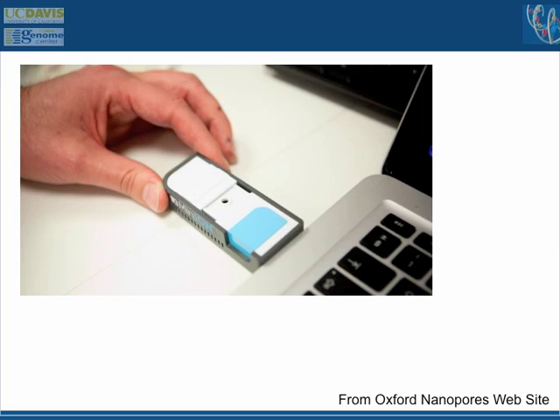So it's unclear exactly what you need to do to feed this machine, if you call that a machine. But there are a few other companies that have been trying to do field DNA sequencers like this. Again, I don't know what the DNA preps for most of them are going to be, but this is single molecule sequencing, very fast, reasonably high throughput. None of the methods that are out there have even come close to the Illumina throughput right now. So for a while at least, if you want to get deep coverage of something, or if you want to count things like RNA, Illumina sequencing is still going to be a great place to do this because the cost per read is still incredibly low for Illumina sequencing.